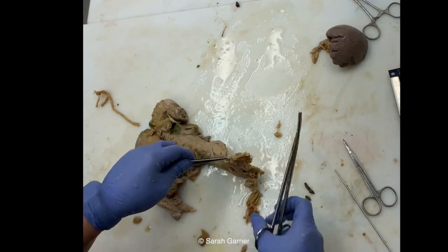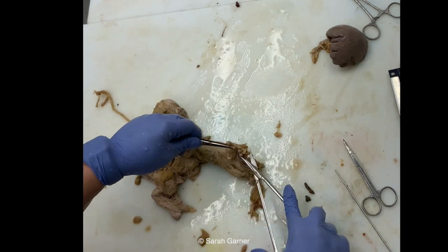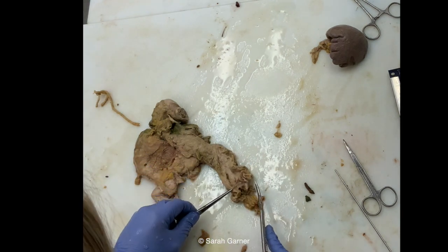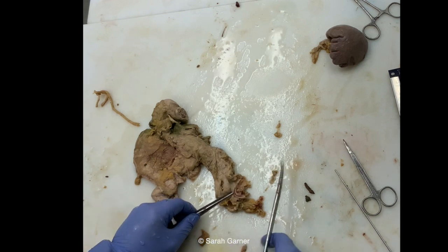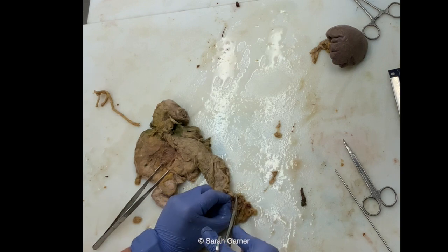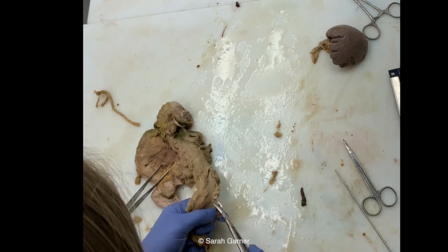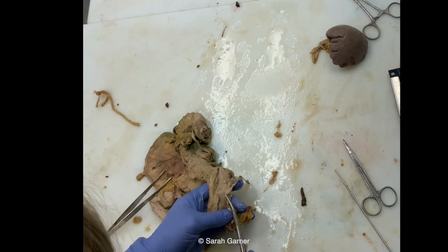Open that up here. See what I mean? When you don't have anything anchored to it, it's so slippery and it can be hard to hold on to things. Since this is our last sectioning, there's not really much left to hold on to, which is why this one is a little more slippery and tricky. But essentially you can open this up all along the artery and just check for any thrombi or anything, especially dependent on the patient's history.